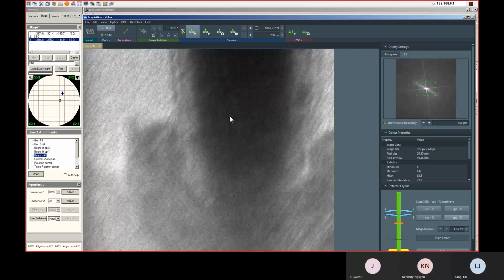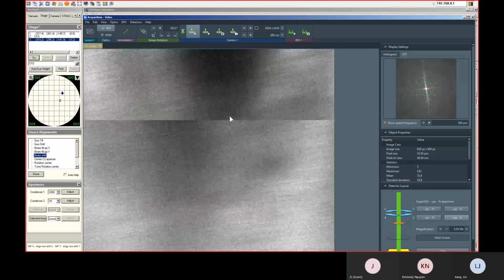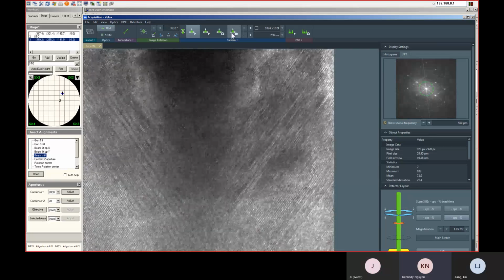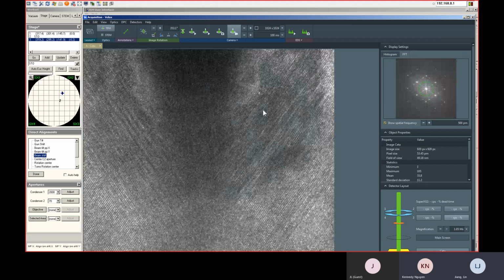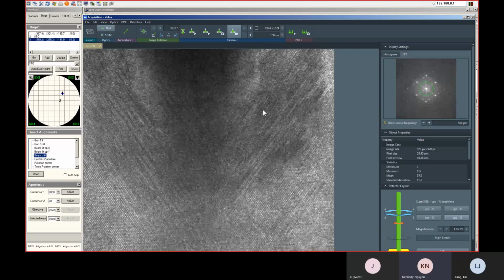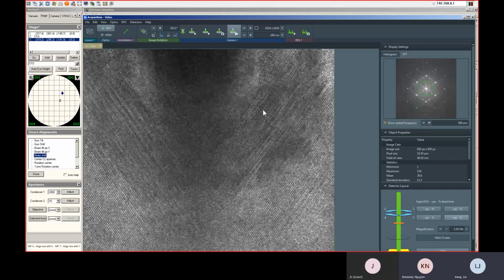Yeah. Okay, let's go here. Let me go over here. It looks good. All right, let's do the camera again. This will be useful because we keep getting a lot of drift from the TEM images for nanoparticles.